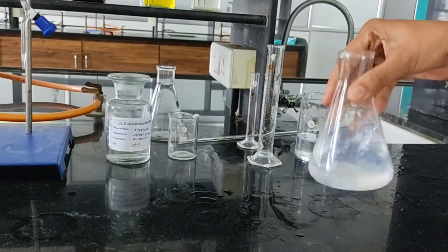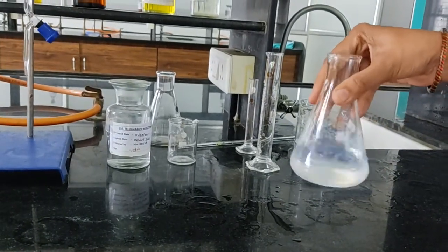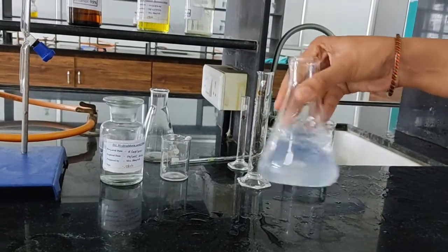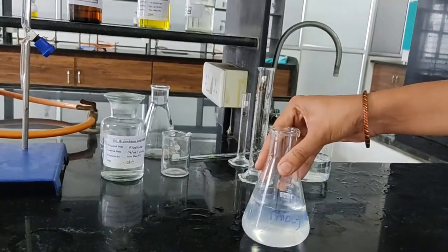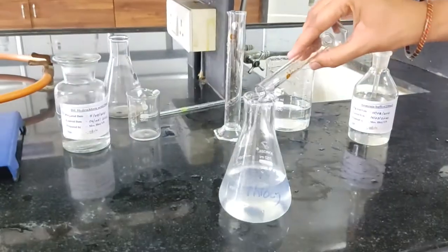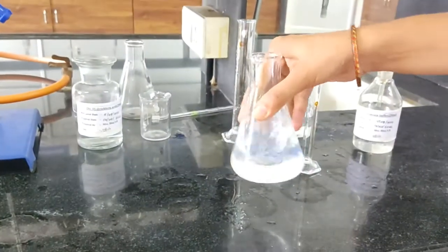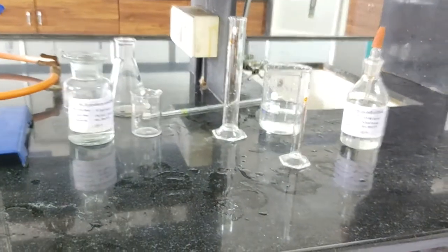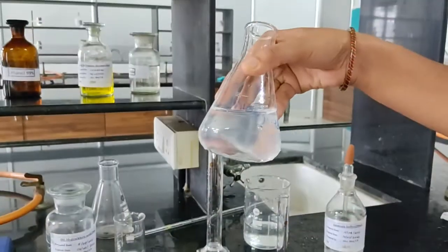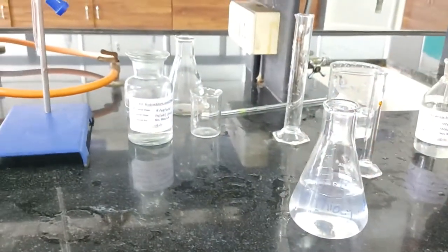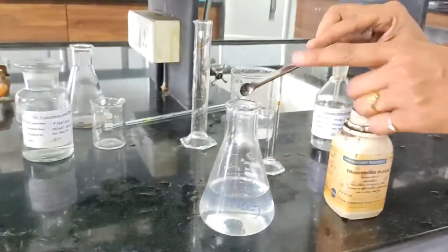And again add sufficient ammonia buffer pH 10 to dissolve this precipitate. 5 ml in excess. So the precipitate gets dissolved into ammonia buffer solution. Here all the precipitate is dissolved in ammonia buffer having pH 10.